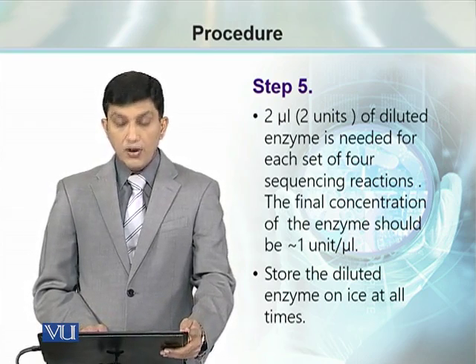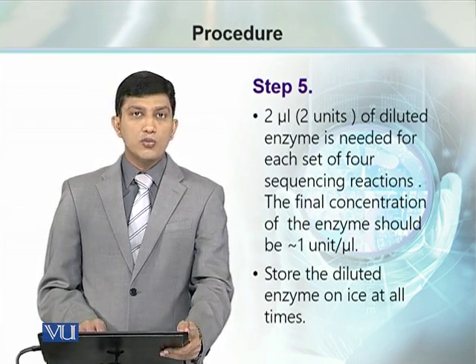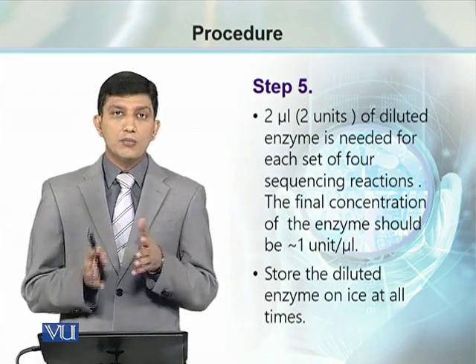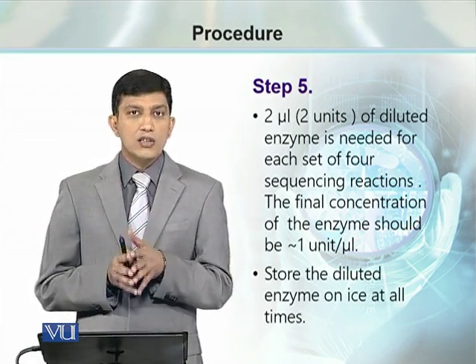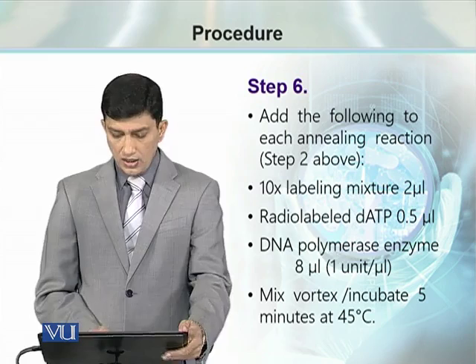That means the final concentration is 1 unit per microliter, and this diluted enzyme is going to be stored on ice because if we do not maintain the storage temperature, then the enzyme can lose its activity and will fail to perform the polymerization reaction.